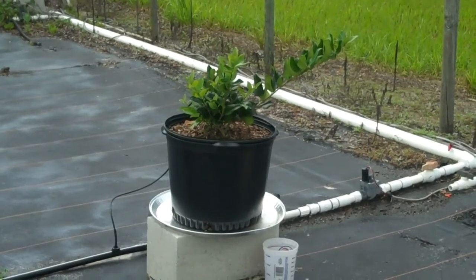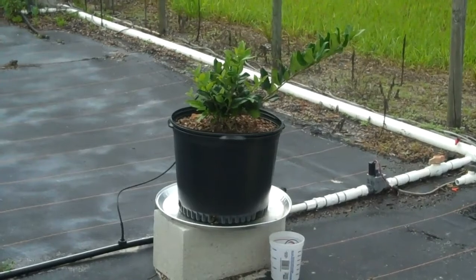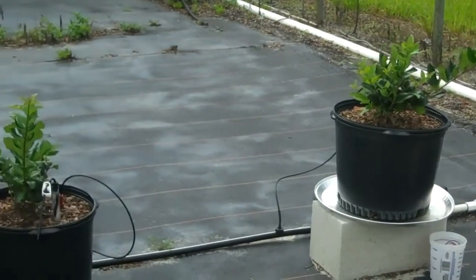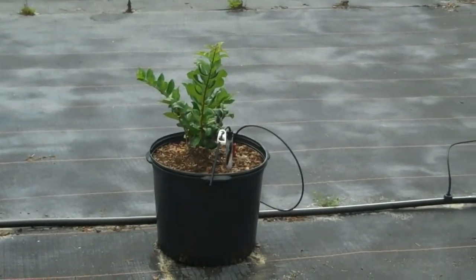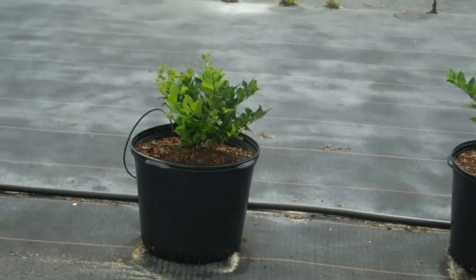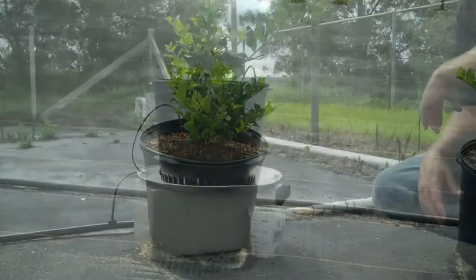We're going to bring you out in the field where we have set up a drip pan system that will measure leaching fraction, but it will also measure a pour-through method. We've got another pot set up to look at a lysimeter method where you're pulling water from the bottom of the pot. And then we have another pot set up where we're going to demonstrate a 2-to-1 extraction method where we'll have 2 parts water to 1 part soil needed.